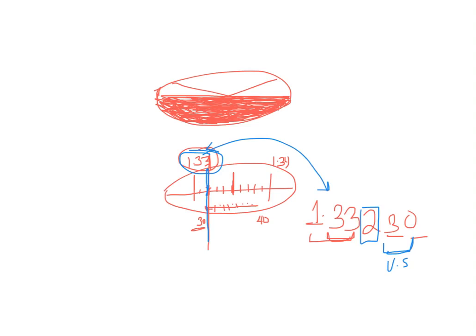And that's your reading. You do this twice. You do this for all 4 of your samples, and then you make a prediction as to what your product is. That means you identify your compound: unknown 1, whatever the identity, unknown 2, whatever the identity, and so on and so forth.